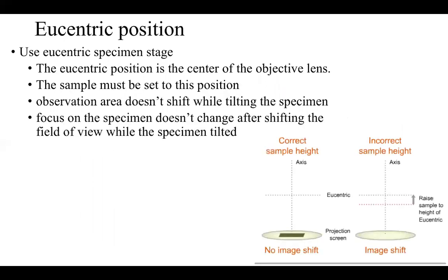And as I told you, to perform all these things and get a very good quality image, you need to make sure that you position your stage at the eucentric position. Right.